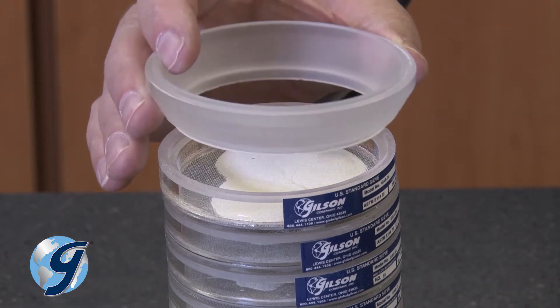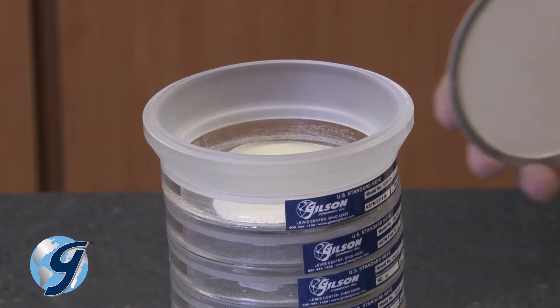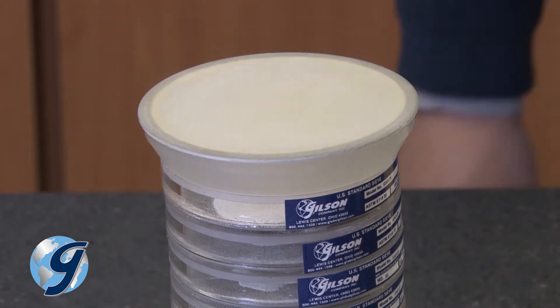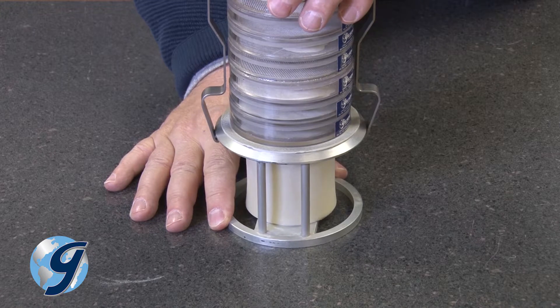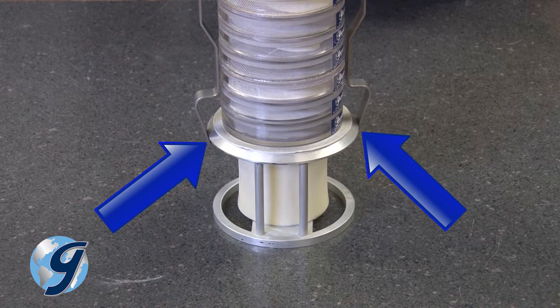Now insert the small end of the top cone onto the top sieve and place the diaphragm on the top cone with the metal ring facing down. Next, place the column lock over the diaphragm and press down until the stack locking bars snap onto the top ring of the fines collector holder.